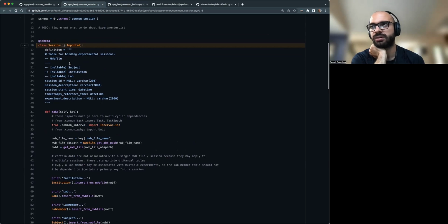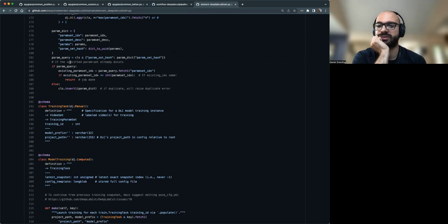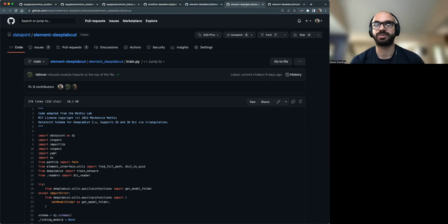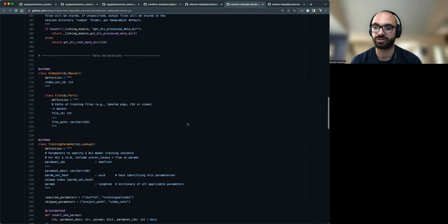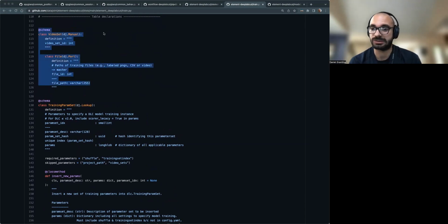So I guess that's something else: the video set is inherently different than our video file. Our video file would be what we run pose estimation on, but our video set would be the ones that we train on. And I guess that's something I didn't have a great grasp on: is the video set supposed to just be all of your training materials, like the videos you train on, your H5 and your CSV, or whatever? In which case I think that might be a little bit different.